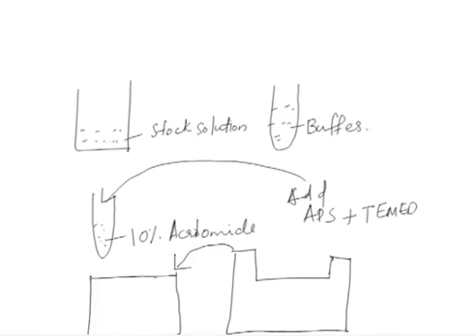Spacers are very thin strips, rubber or some other material, only a few, say 0.5 mm or 1 mm, and they will be placed in here, and this plate will be placed on top of this. So, what you will find is this plate is put on top, and they are separated by the spacer. All right. So, there is a gap between the two plates. This has to be understood: when the two plates are put on each other, they have a gap because of the spacer.